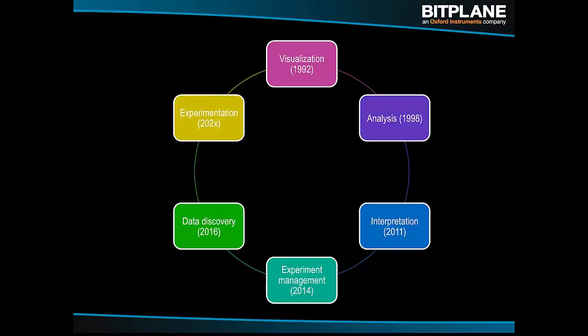And with the database and with the pool of data that we have globally, if you think about it, all of these people doing pretty similar things, a lot of people doing cell tracking. Out of those 10,000 or 15,000 people, probably 30% do cell tracking. There are probably trends in there that don't require additional experiments, just require good software tools to take out some interesting trends and maybe then focus the experiments on those trends rather than do full-size experiments. Anyway, that's what we have been doing. This is where we are going.